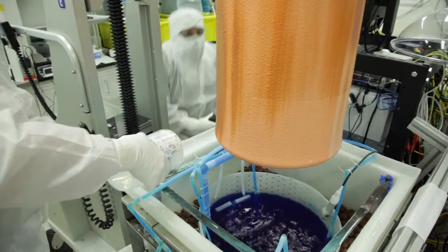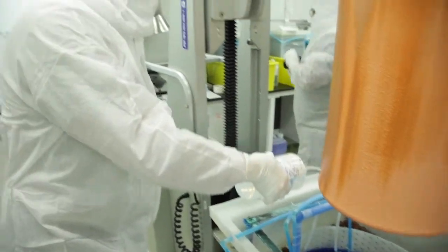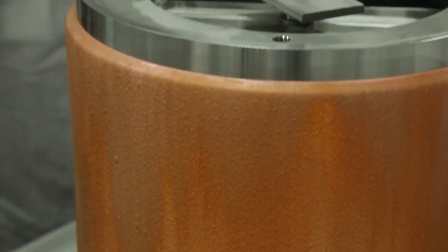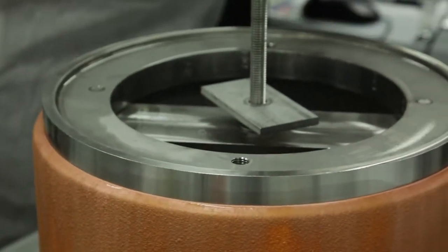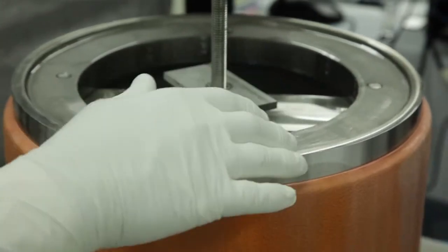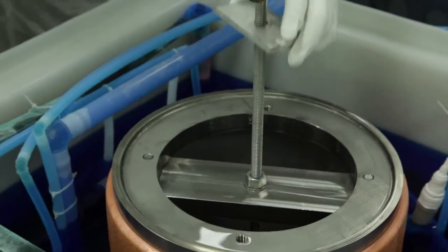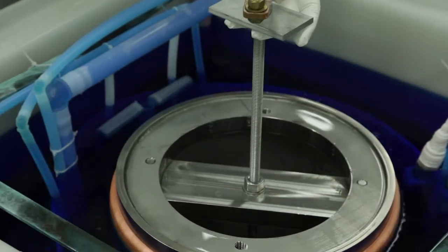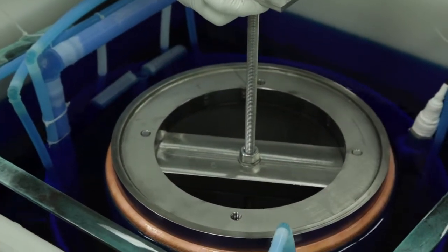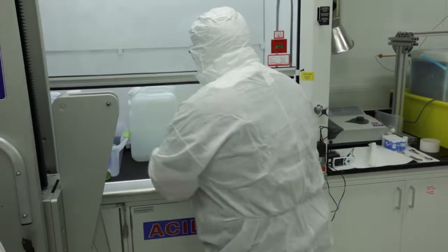That all goes into solution and now on the cathode there is a stainless steel mandrel that is in the general shape that we would like it to be for use later on in our radioassay detector that we're going to build, and copper will plate on that and we build that up to whatever thickness we are choosing.